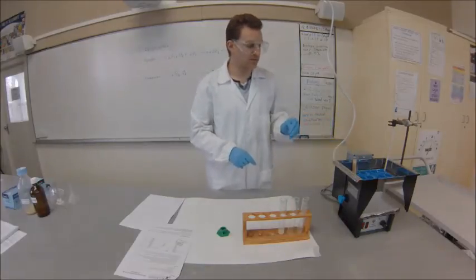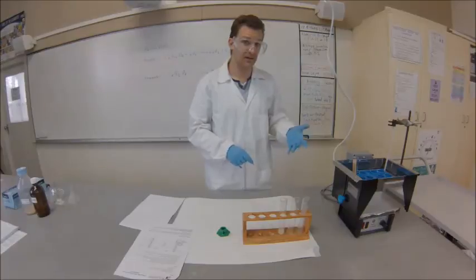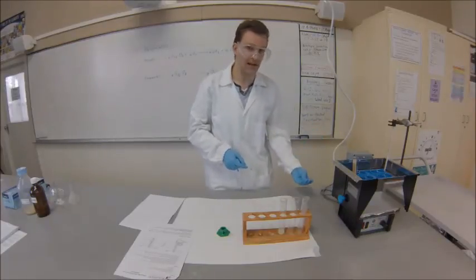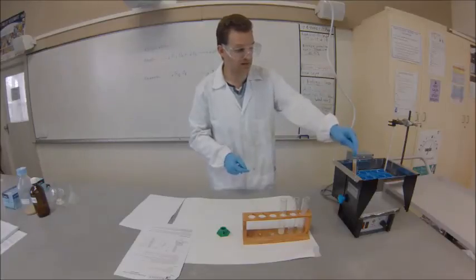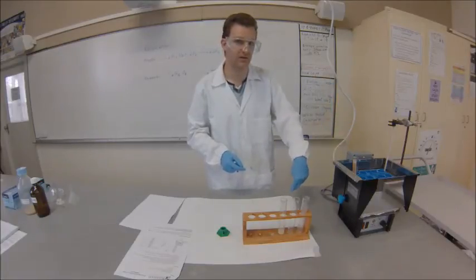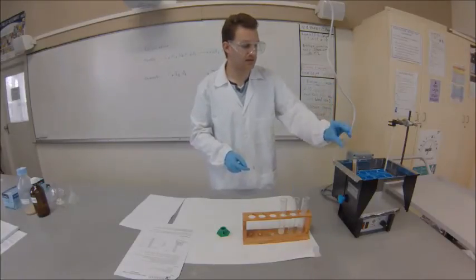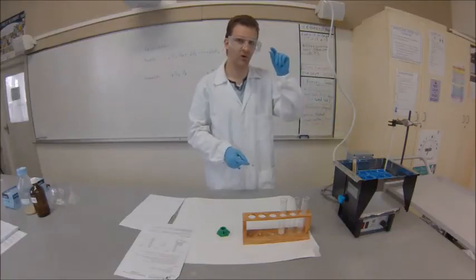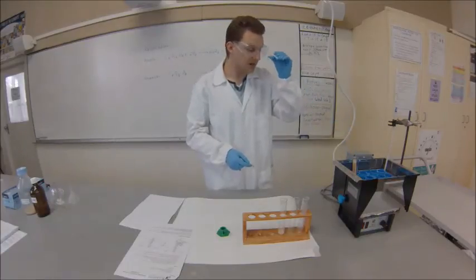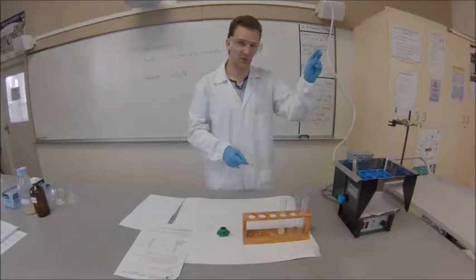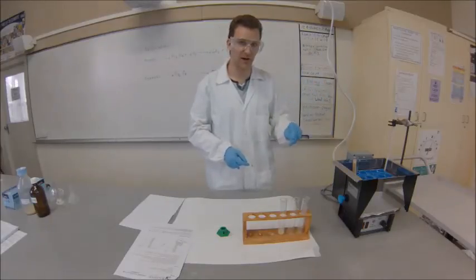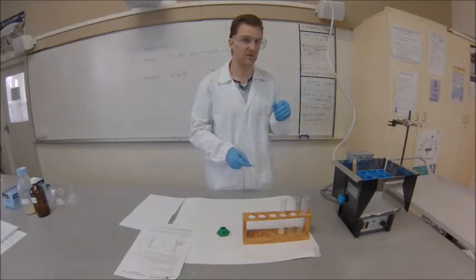We put it into the water bath and let it sit for 10 minutes to incubate. Respiration will be carrying on, forming CO2 gas. That gas will bubble up to the top and push the liquid down. After 10 minutes, we'll take it out and record the new volume. The difference between the initial and final values is the total amount of CO2 produced in that 10-minute period.